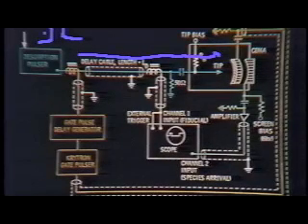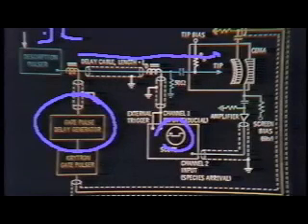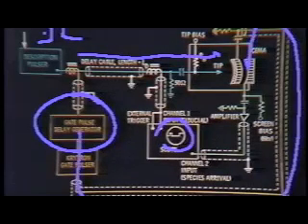And we use that pulse to trigger an oscilloscope sweep so we can determine a mass-to-charge ratio. But we can also use that pulse to trigger another pulse generator that supplies a pulse to turn on the detectors, coincidentally with the arrival of a particular mass-to-charge ratio. And that's all that's needed. Very simple instrumentation.